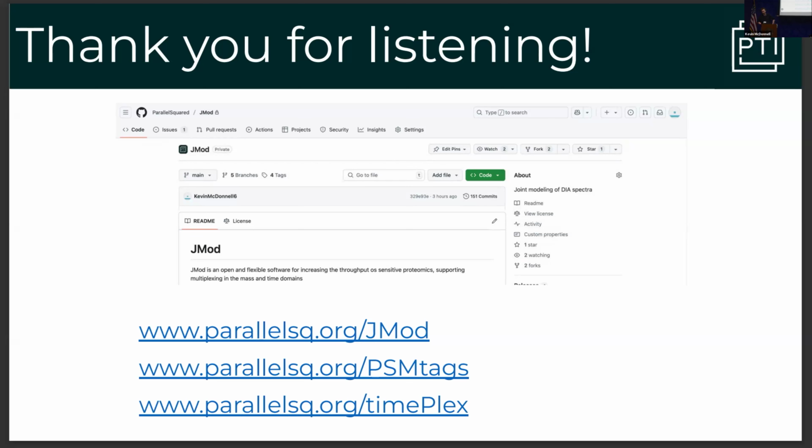But yeah, that's one of the advantages of multiplexing: you can boost your signal. But alternatively, you need to have strong channel FDR to account for that, so you're not giving false identifications either.